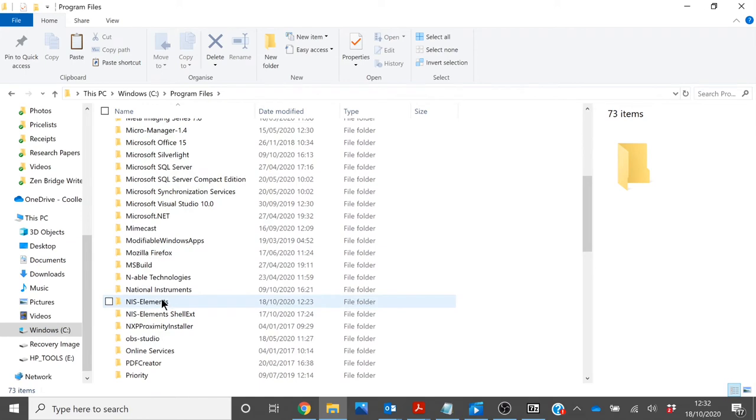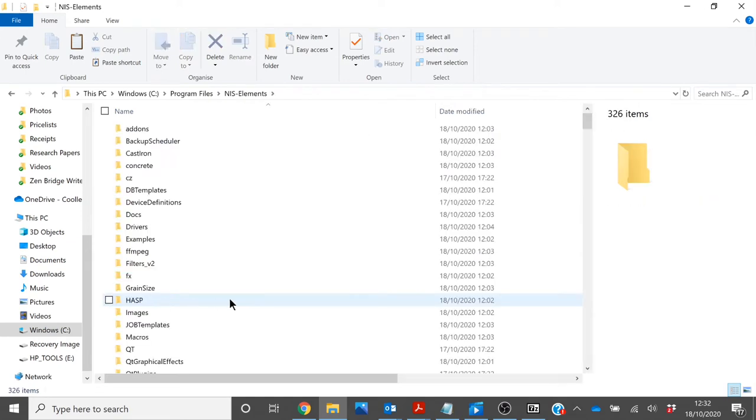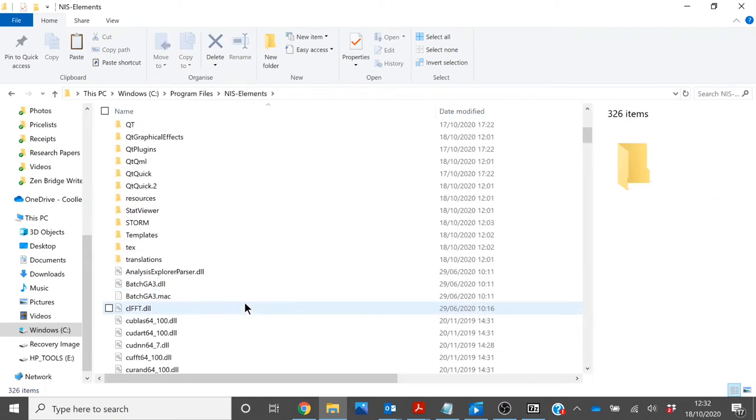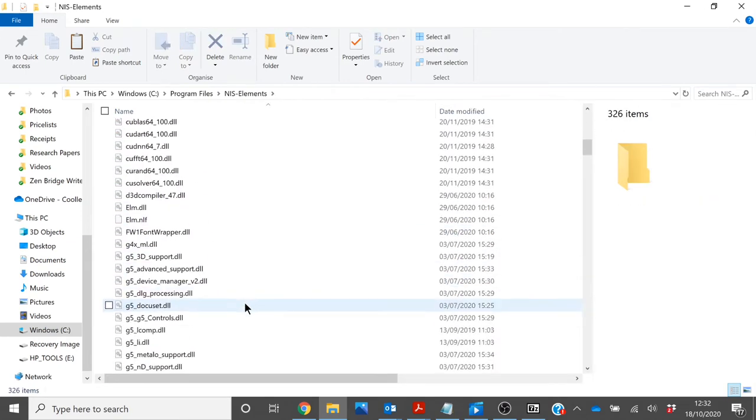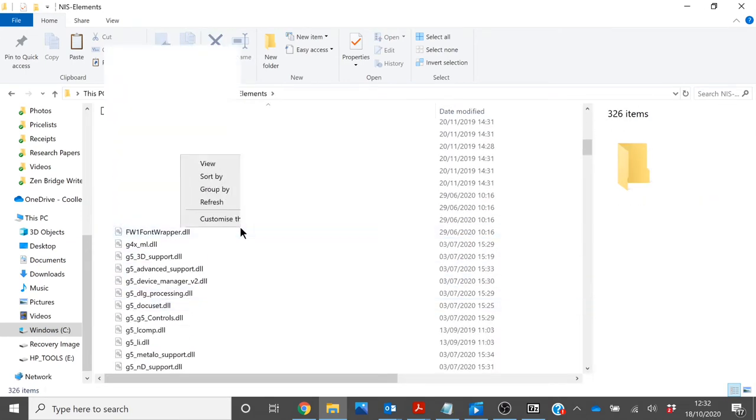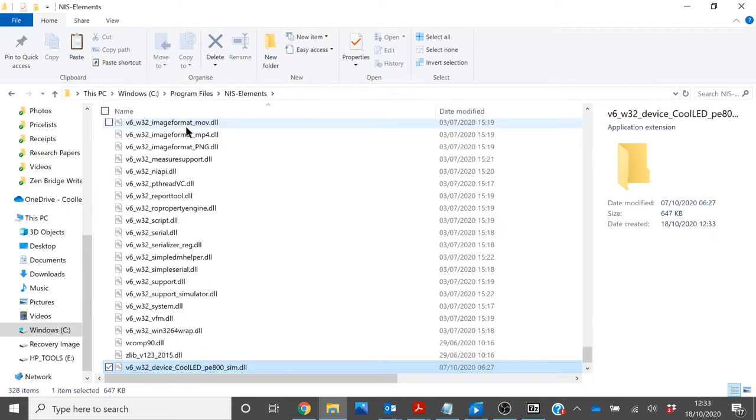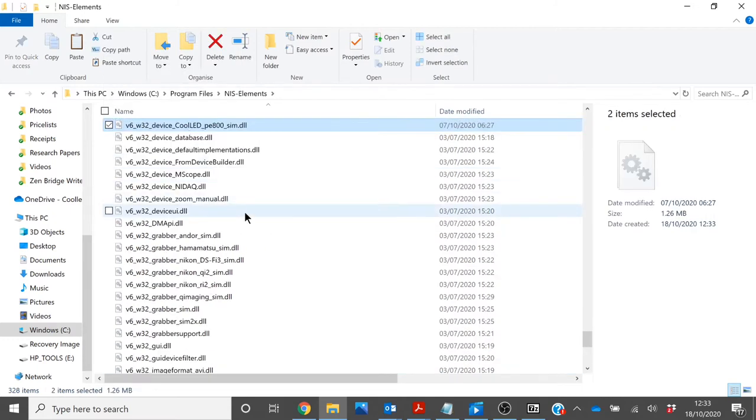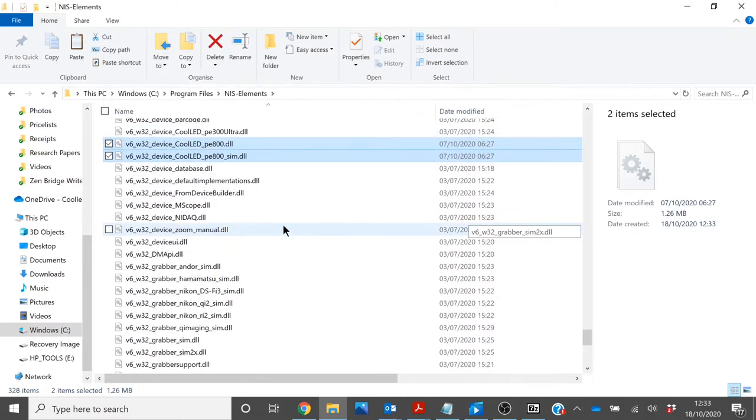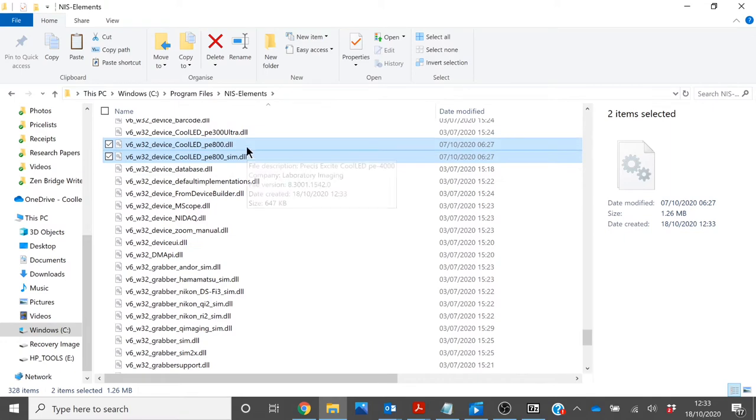Once you have found NIS Elements, scroll down to the other DLL files, right click and paste. The CoolED DLLs will then be copied into this folder.